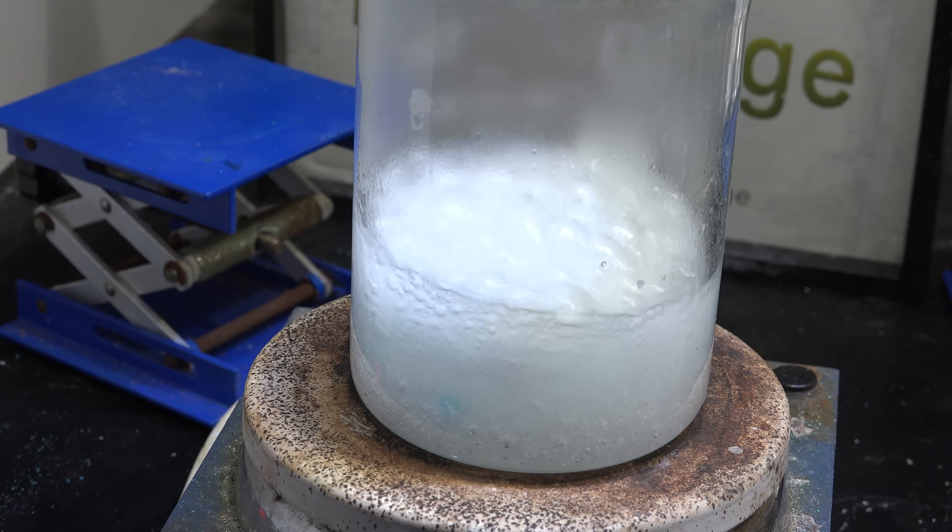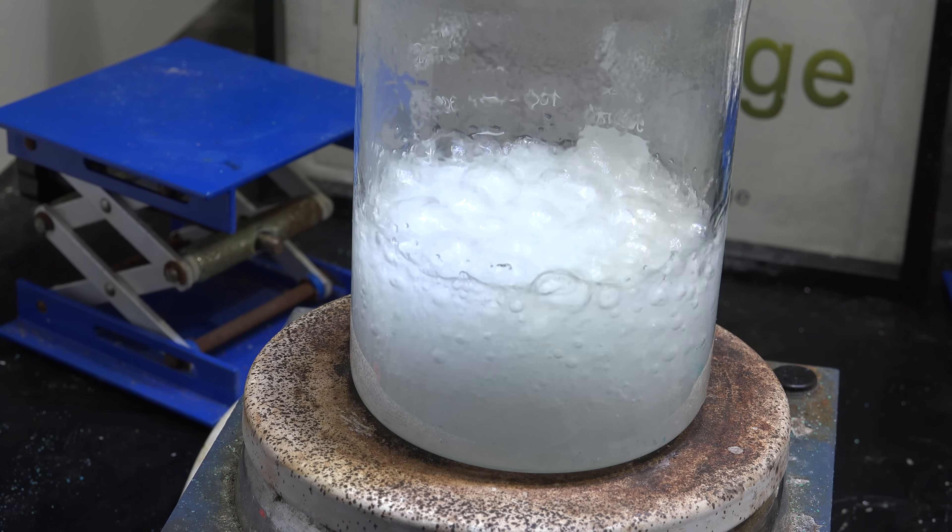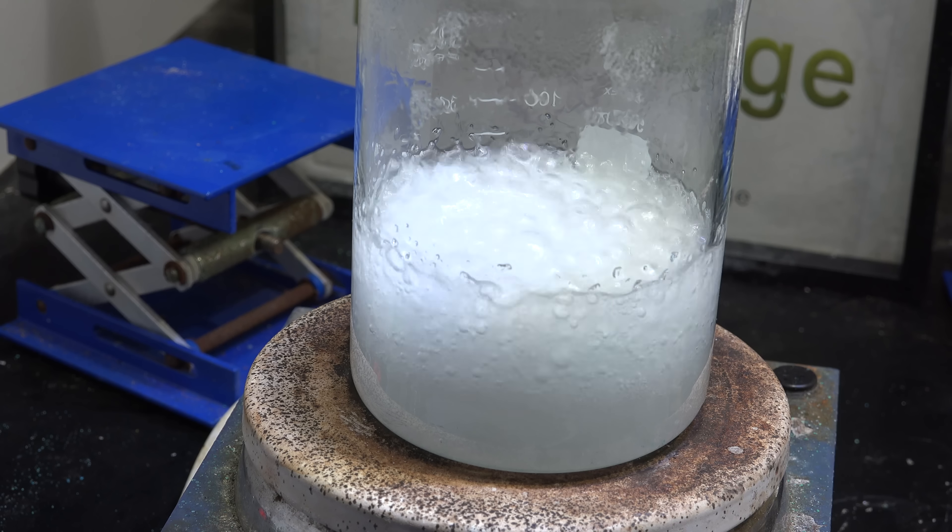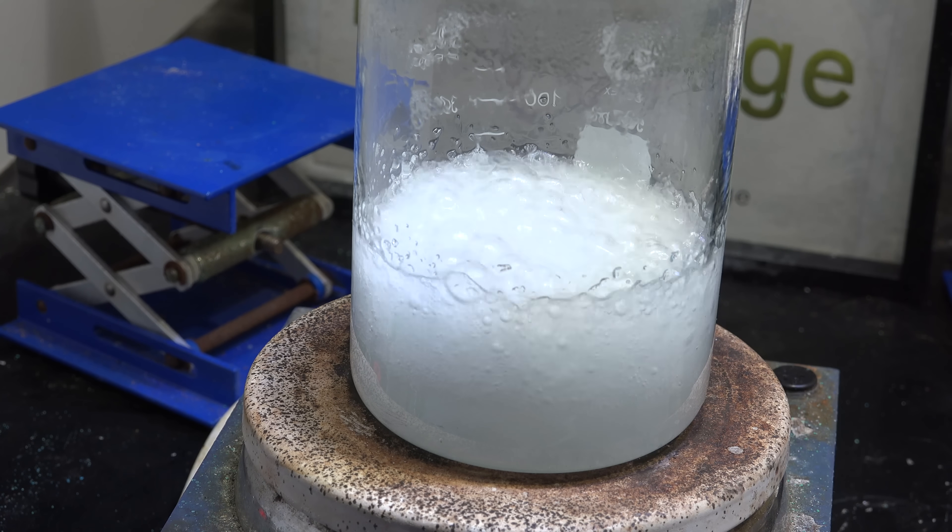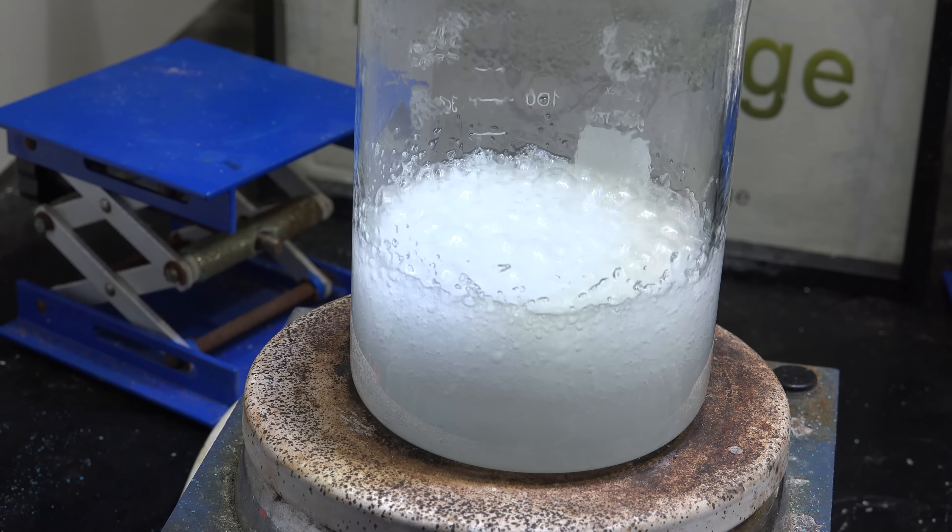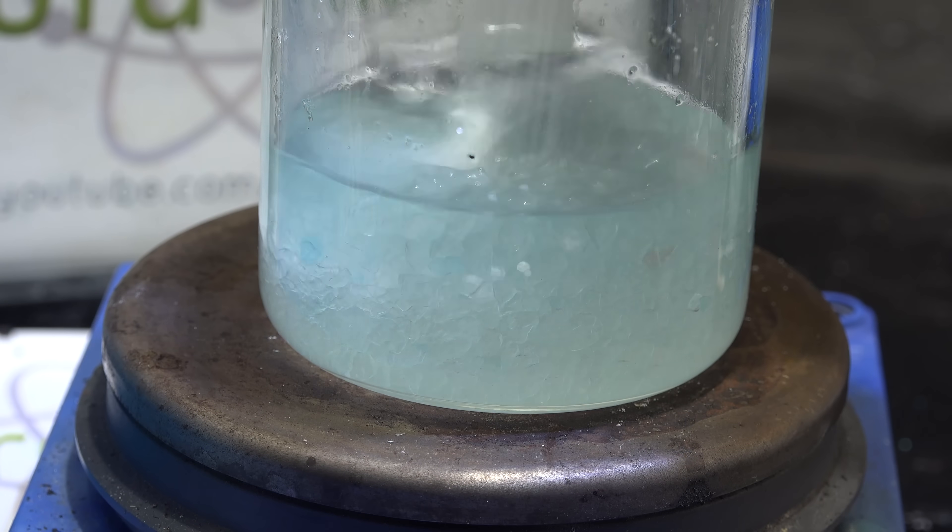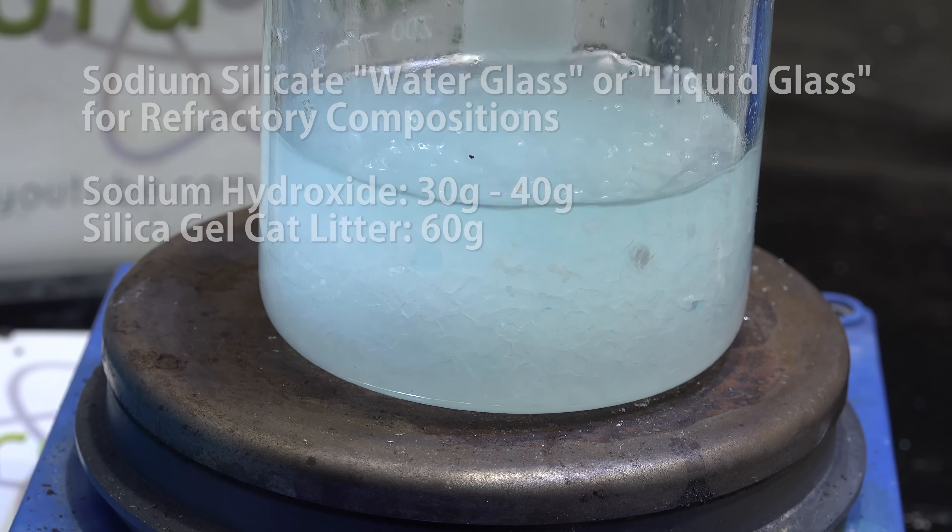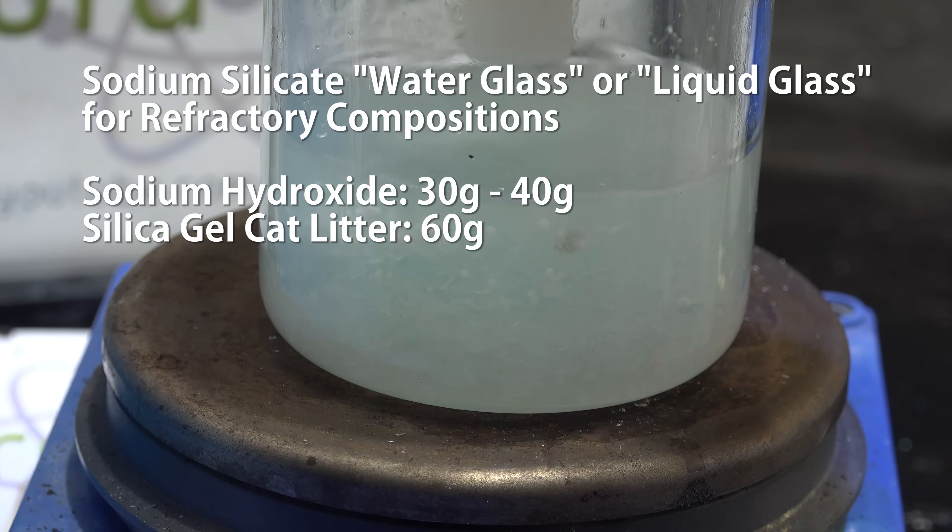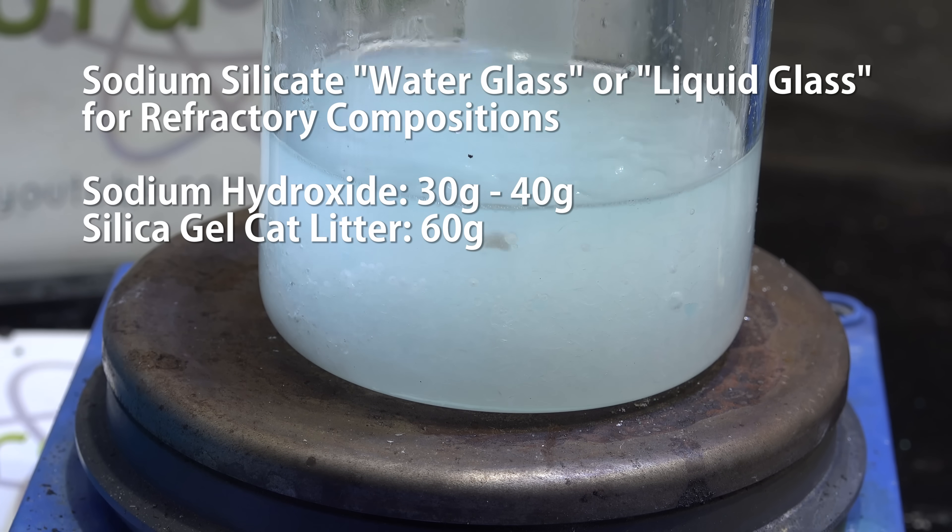Now a special note for those of you using sodium silicate for making insulating liners, forges, and other refractory uses. Those mixtures require a silica-rich mixture rather than the sodium hydroxide-rich mixture I'm showing here. So you'll want to modify the original procedure to use a 3 to 6 or 4 to 6 ratio of sodium hydroxide to silica gel rather than the 8 to 6 ratio I presented here.